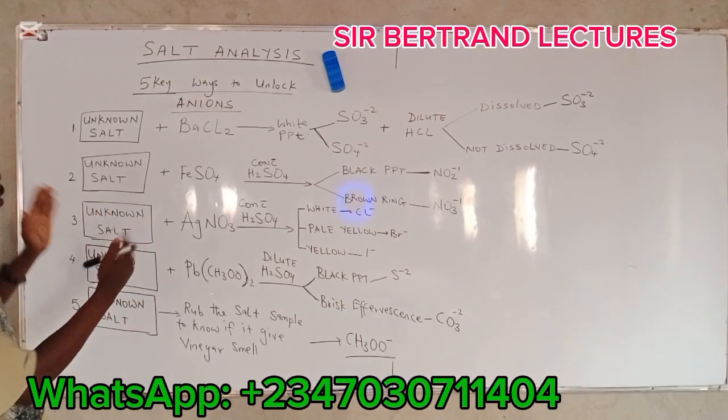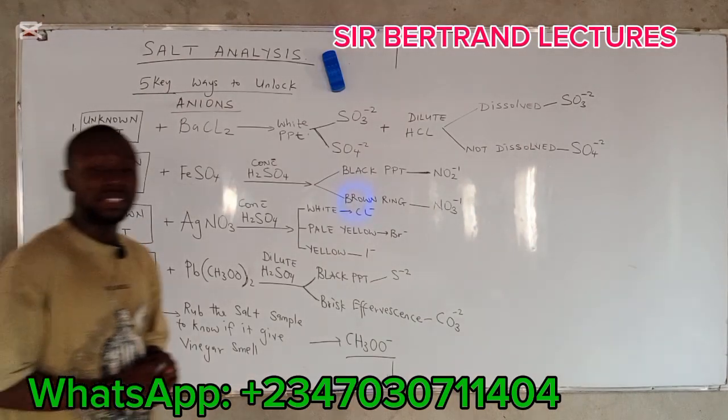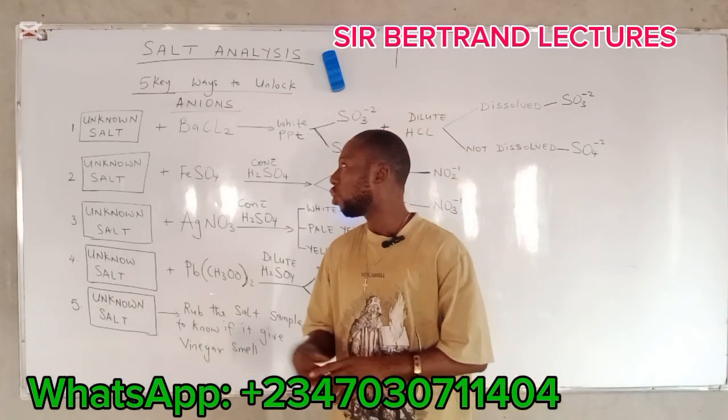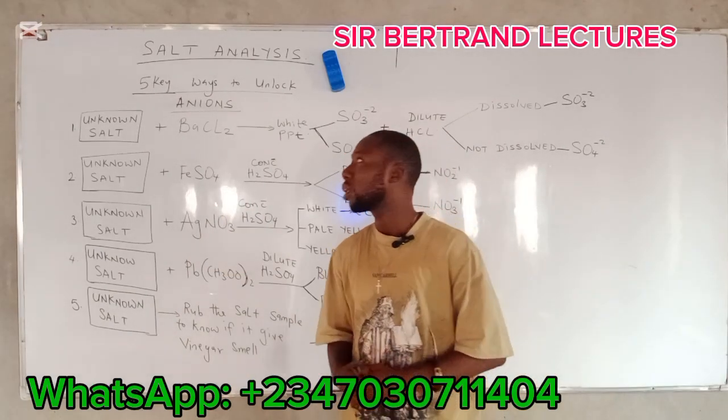All right. So here on the board are the 5 key ways to unlock the anions present in a given unknown salt sample. All right.